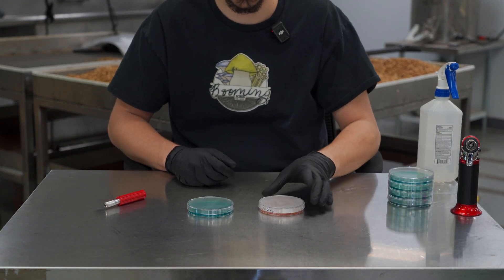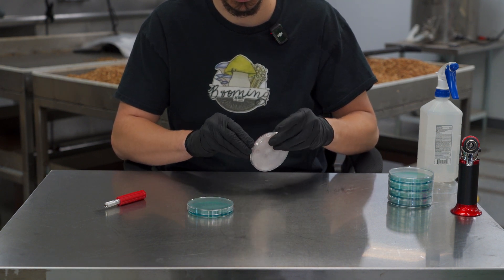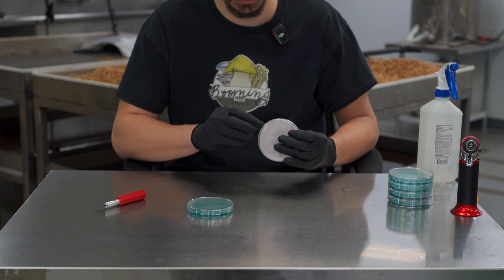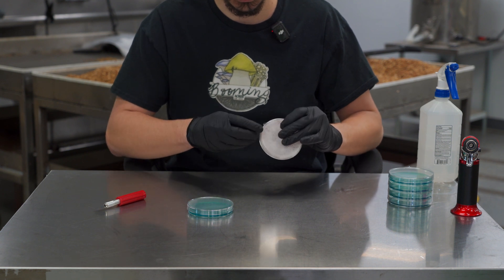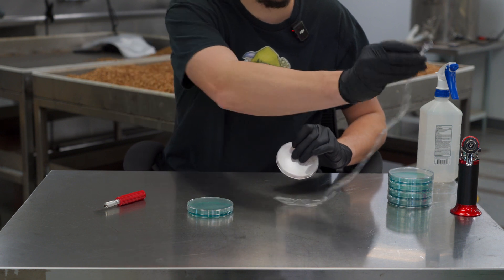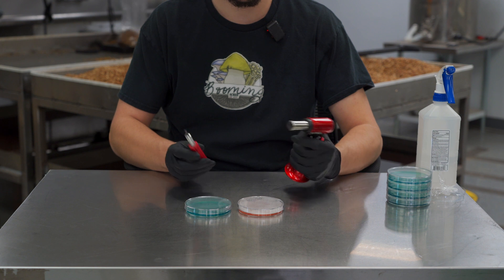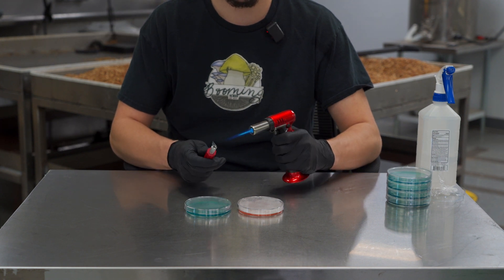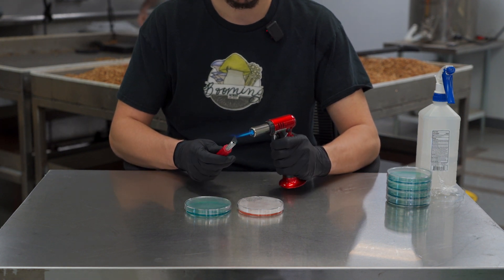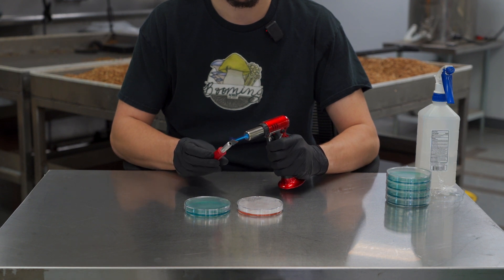To do transfers, take a colonized plate and remove the tape or parafilm that you have sealing the plate. Then take a blowtorch and your exacto knife, and heat up the exacto knife tip until it's hot.